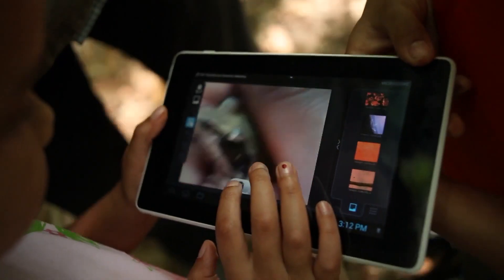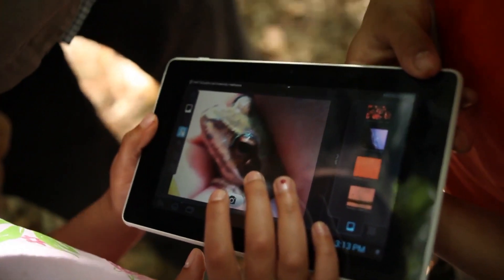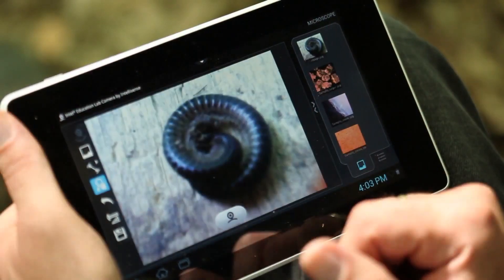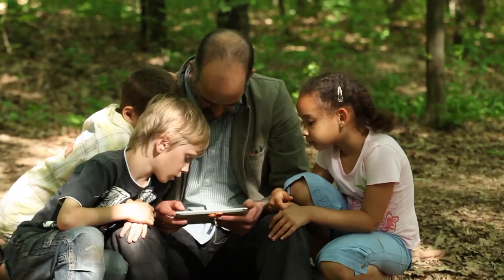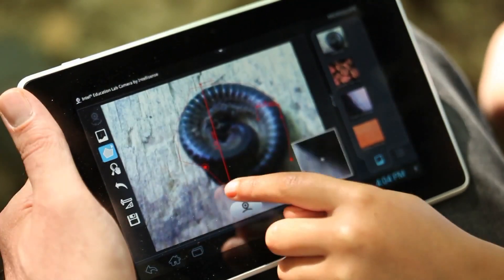Besides performing microscopic measurements, this function can also measure distances, diameters, and sizes of objects, large or small, near or far.